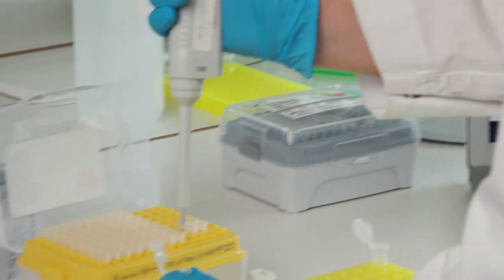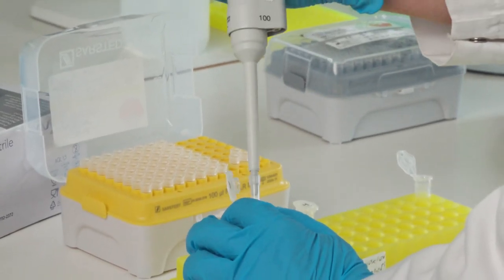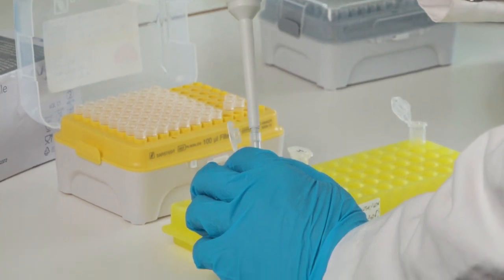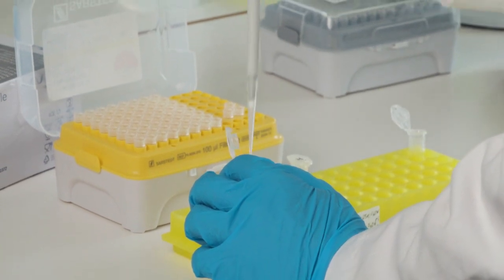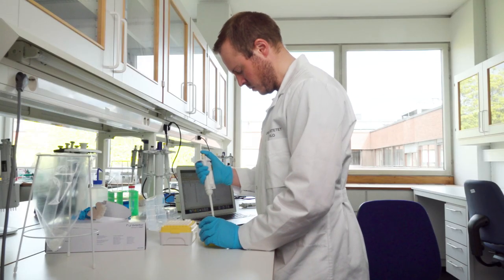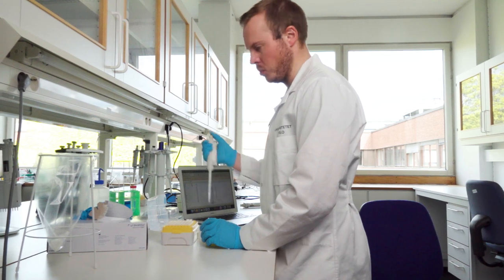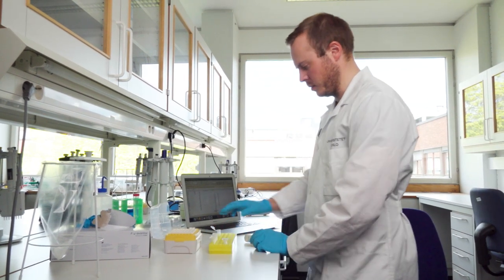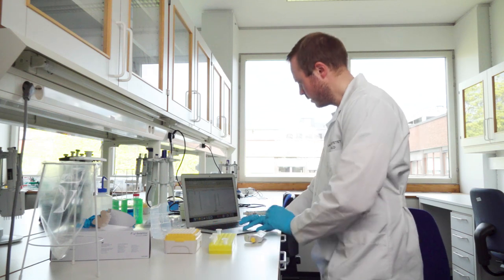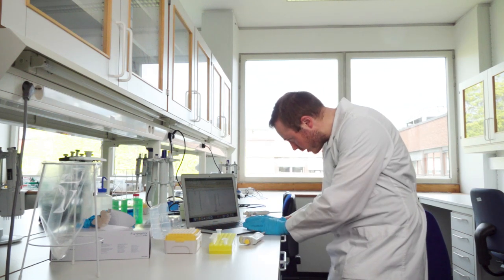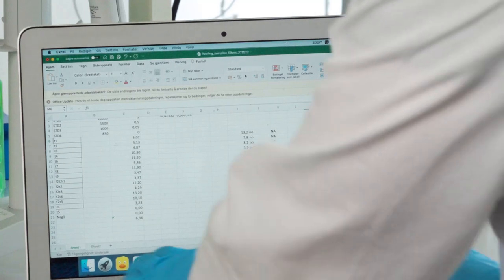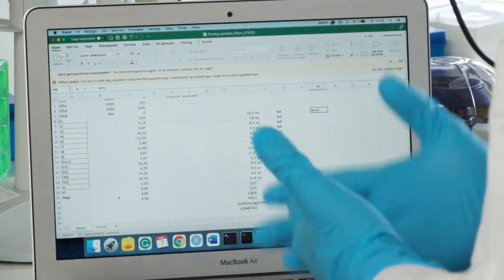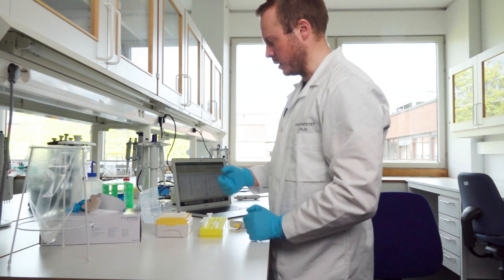Open it, take the required volume out, add it into the tube. Okay, now I'm done with that. And then I close this. And I like personally at least to write done, so I'm sure that this has been done before I take the next one.